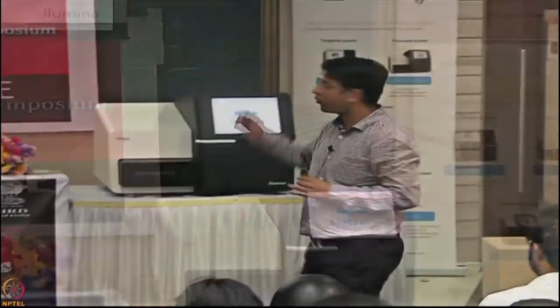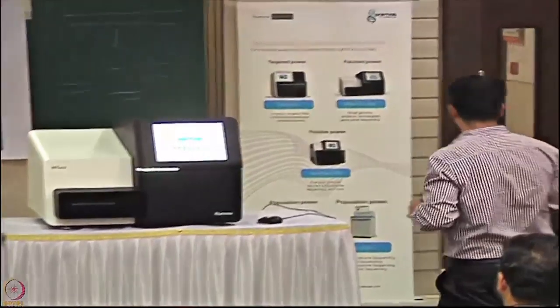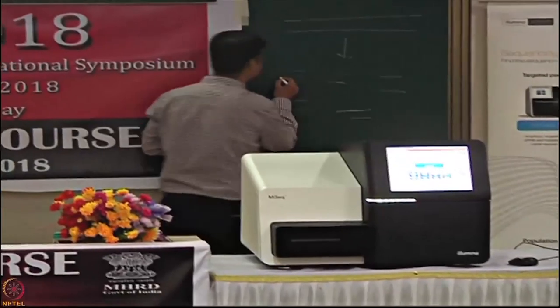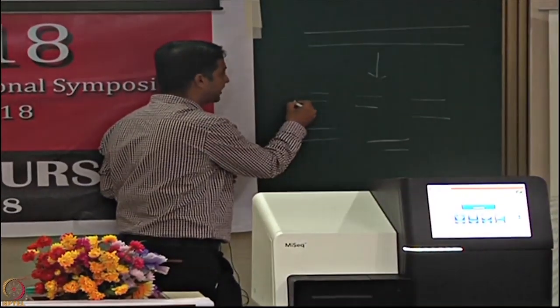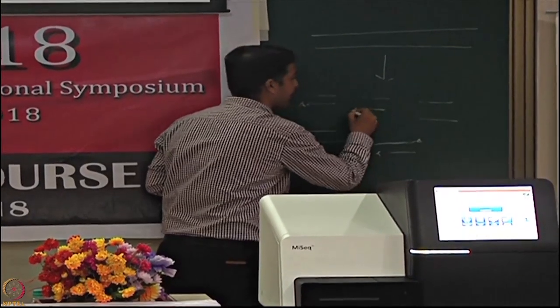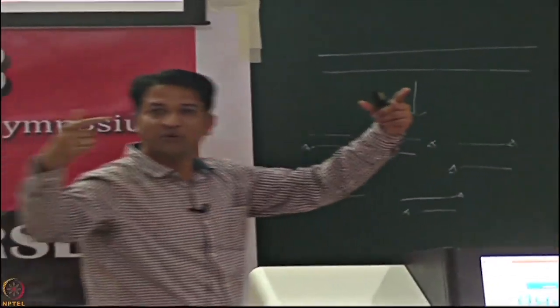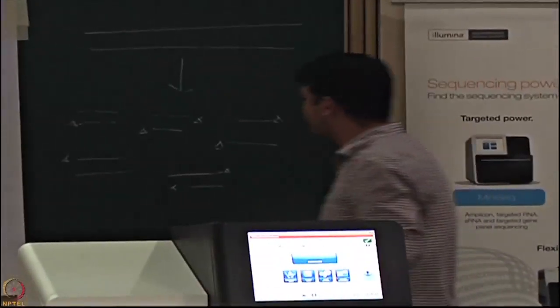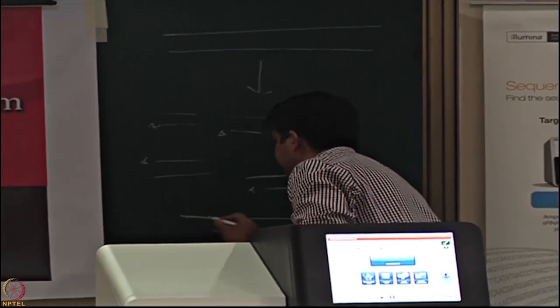Right, you remember now. So what we will do is, initially we will use a polymerase. If you have many fragments, initially we convert all ends into blunt ends, and we add a polymerase. The tendency of polymerase is that it will add an A to all the ends, right? And then we have an adapter which contains a T over there. There will be a simple ligation step. So those fragments will be converted into fragments ligated with the adapters.